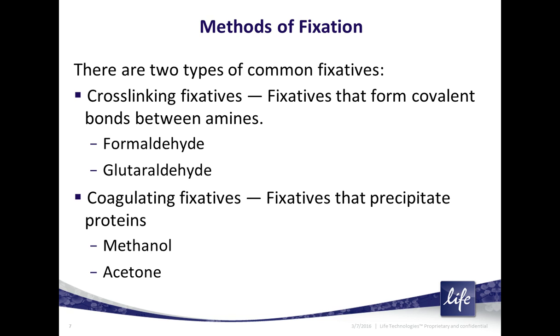Now, I want to draw a distinction between formaldehyde, paraformaldehyde, and formalin. Formalin has a methanol stabilization in it, so it has methanol contained in it. And for some experiments, that small amount of methanol can actually make a difference.